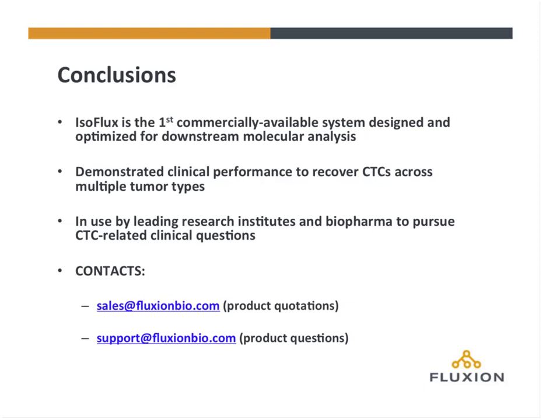Okay, there's a question here about how to add your own antibody and what that protocol is like. So this is using our rare cell enrichment kit. And the preferred method here, we have a complete protocol that we supply with the kit, and this is available online. If you want to go ahead and take a preview, you can look in our download section and actually get the complete protocol.